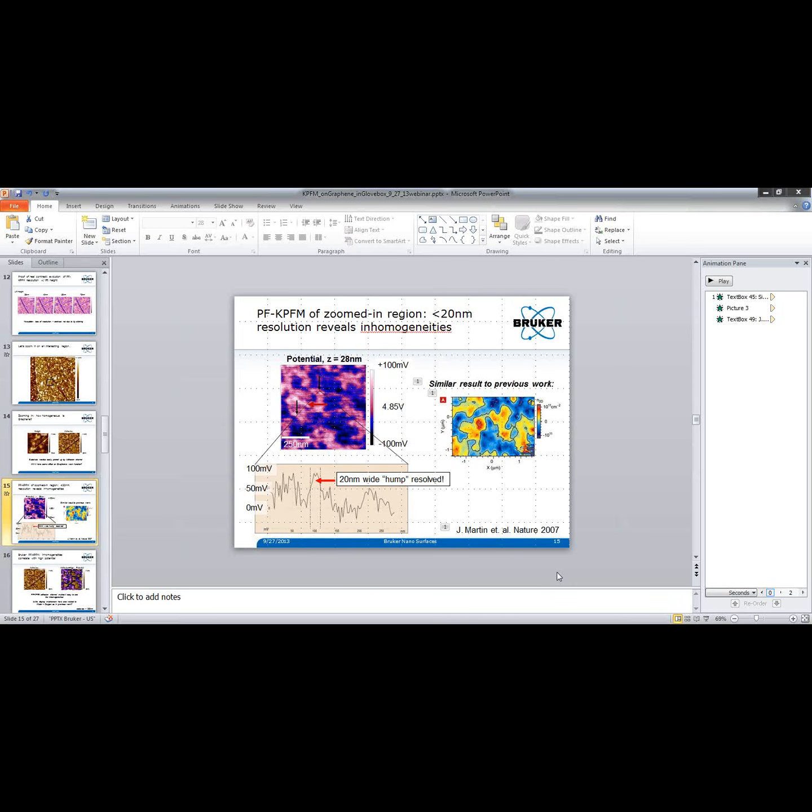So yeah, it would not be an easy experiment, but it would be very interesting. And I think the first part of your question was verifying that it's indeed a suspended window of silicon nitride, and yes, it's a silicon nitride window with nothing below it, basically.